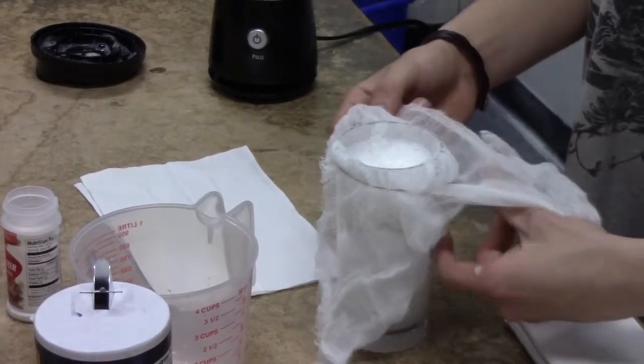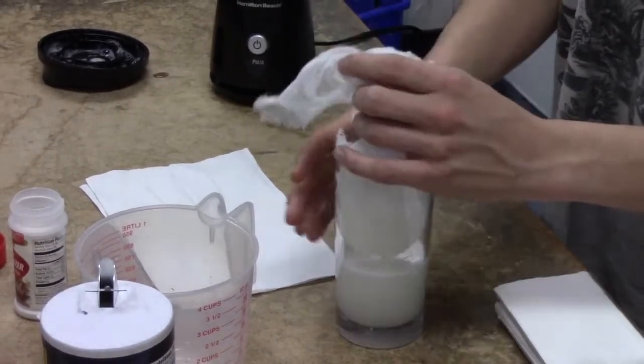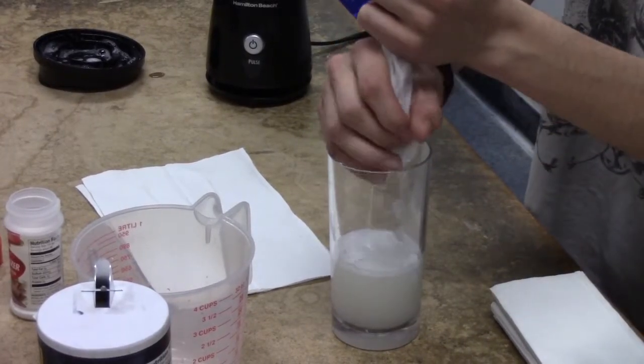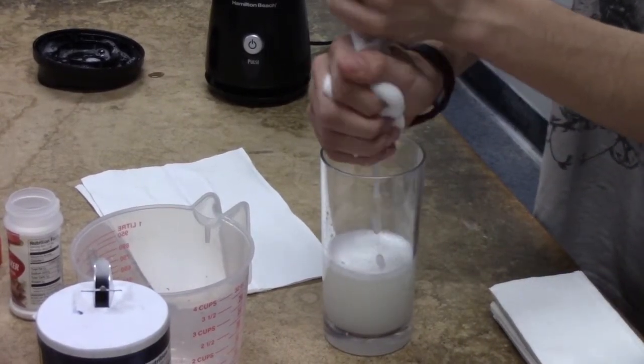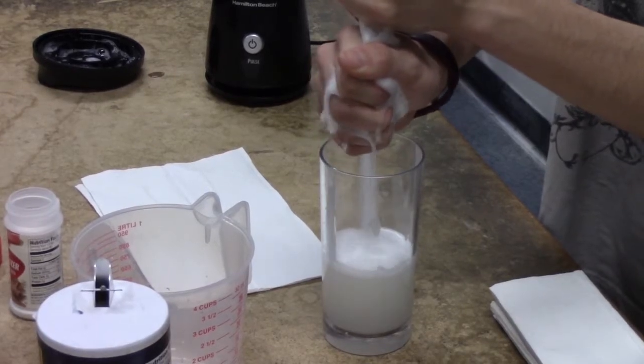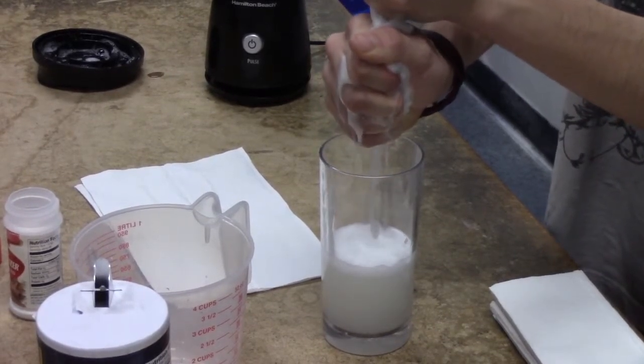Before taking the cloth off the cup, we're going to give it a good squeeze so that we can get out any onion juice that has been left behind. Don't be afraid to get messy, make sure to get all of it in there.